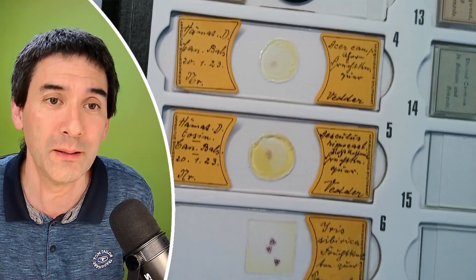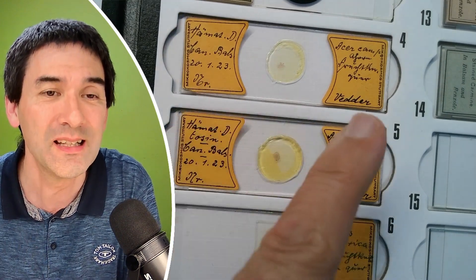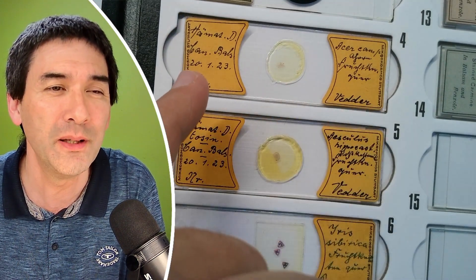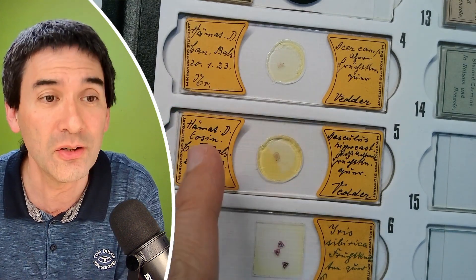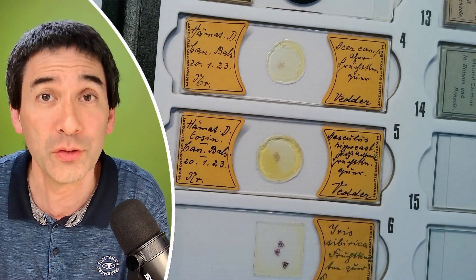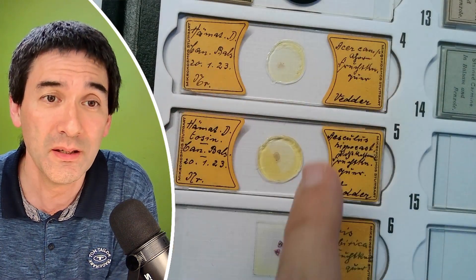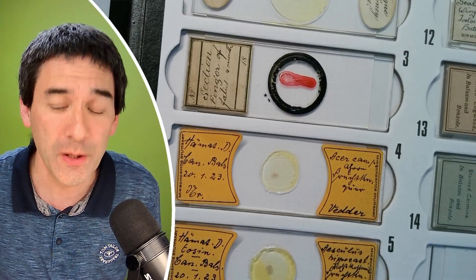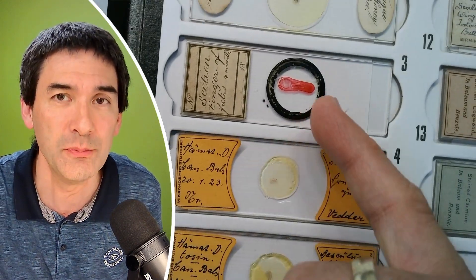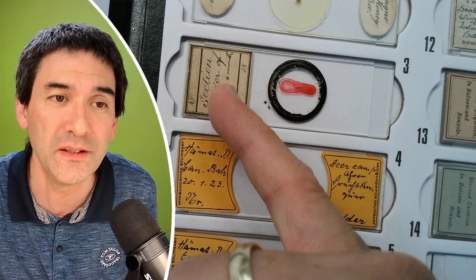Unfortunately this information is not always present. Here it is — it's labeled in German: 20th of January, 23. This must be 1923. So this slide here must be over 100 years old, and I also believe that because the writing is a very old-fashioned style. By the way, this here is also one — this is actually maybe one of my most controversial slides. It's the finger of a fetus, a four-month-old fetus.